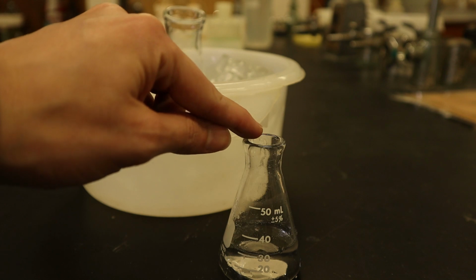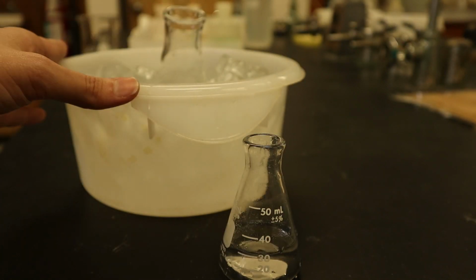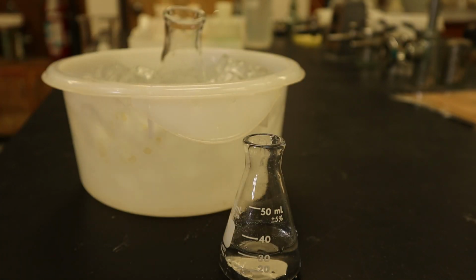Now we're going to place this 50 milliliter Erlenmeyer flask into this ice water bath and we should see that some crystals start to form.